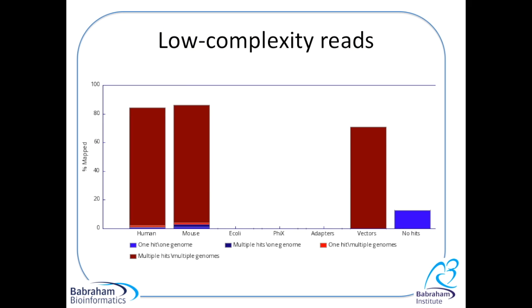In our final example, we see quite a different picture. Here we have reads which multi-map to multiple locations in the human, mouse and vector reference genomes. These reads also map to more than one genome. This is quite common when we see low complexity reads, for example poly A's or poly T's, which are found repeated in many genomes. This suggests that something has gone wrong during the library creation and you may need to go back and troubleshoot your experiment to find out why you've not amplified what you thought you'd amplified.